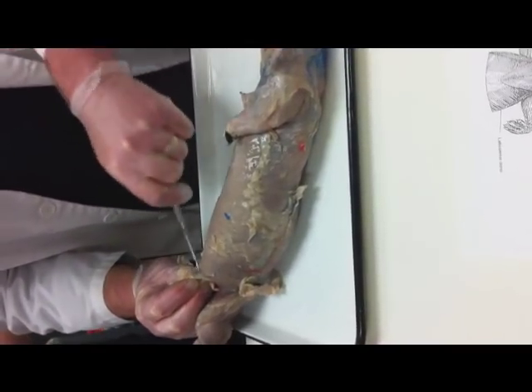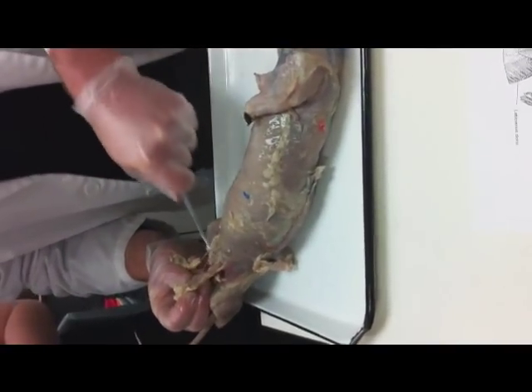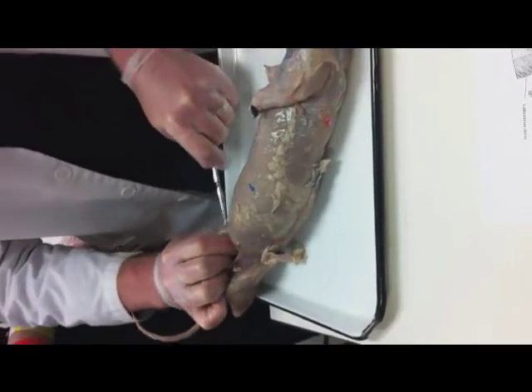Through the clear, it's always good to take out the clear stuff. And I'm probing back and back and back. This is a little boy, and he has genitalia.